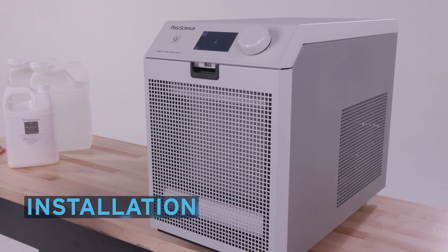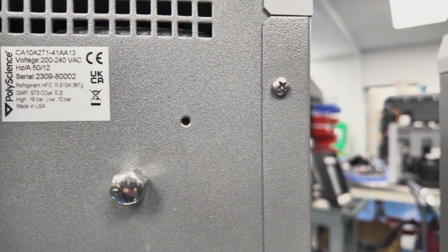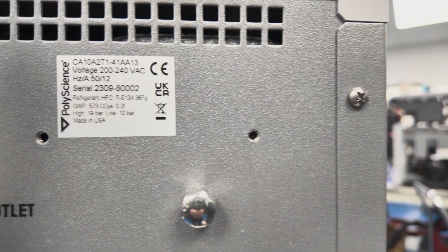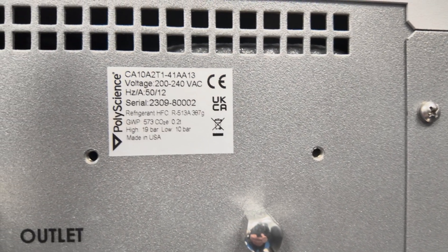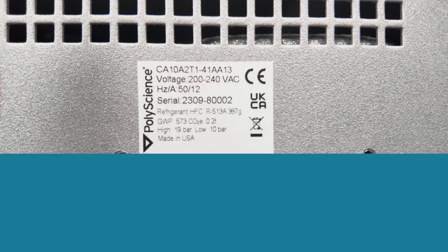Installation. When installing the chiller, first check the serial number tag to be sure you are plugging the unit into a grounded outlet with the correct voltage and frequency.